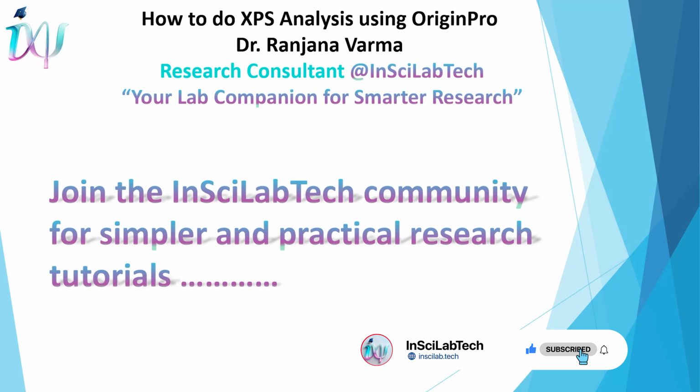Join me in part 2 of the series where we will perform high resolution Ti 2p fitting.